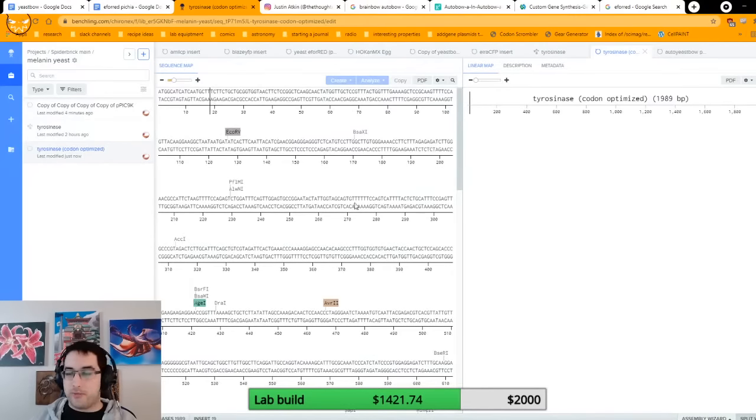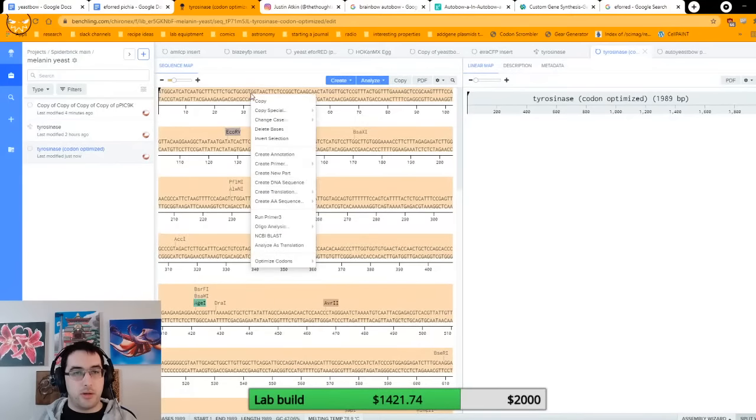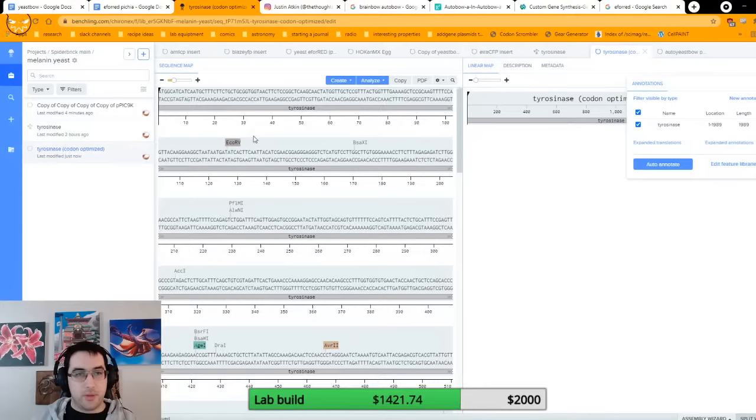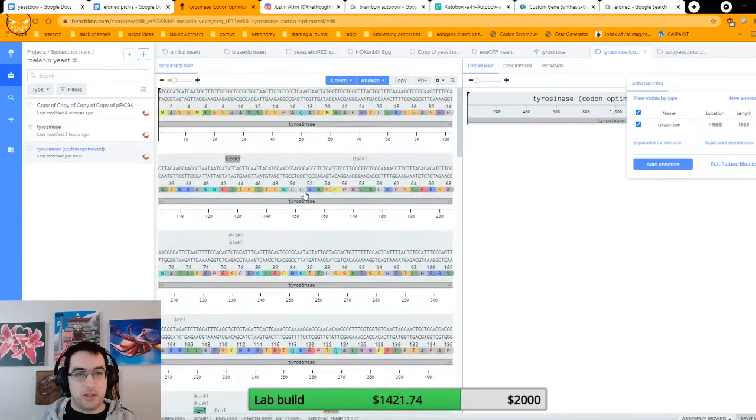First things first, now that we have our bit of DNA, we select all. First we've got to annotate, because annotate your code. There's nothing worse than not annotating your code. Tyrosinase, thank you very much. Make it this lovely chocolate brown. Save annotation. Cool. Now I want to make a translation.